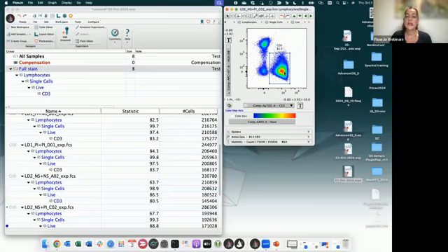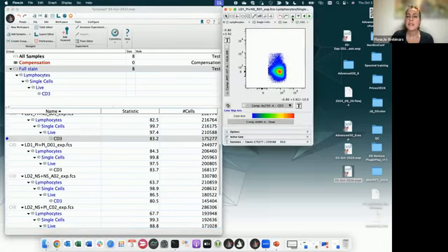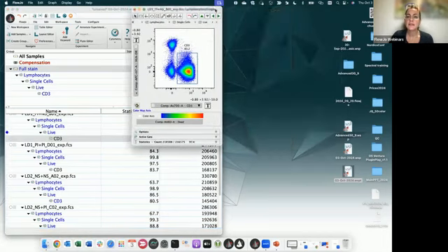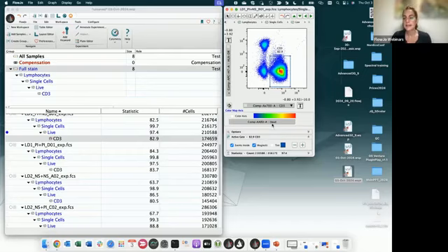One option that could actually help in automatically moving the gate into the right position, which is something different, so it's not a fixed gate, it's not an individual gate, it's a gate that would automatically move if the population shifts. Something that you can do is making this gate, going to active gate, and make this gate magnetic.